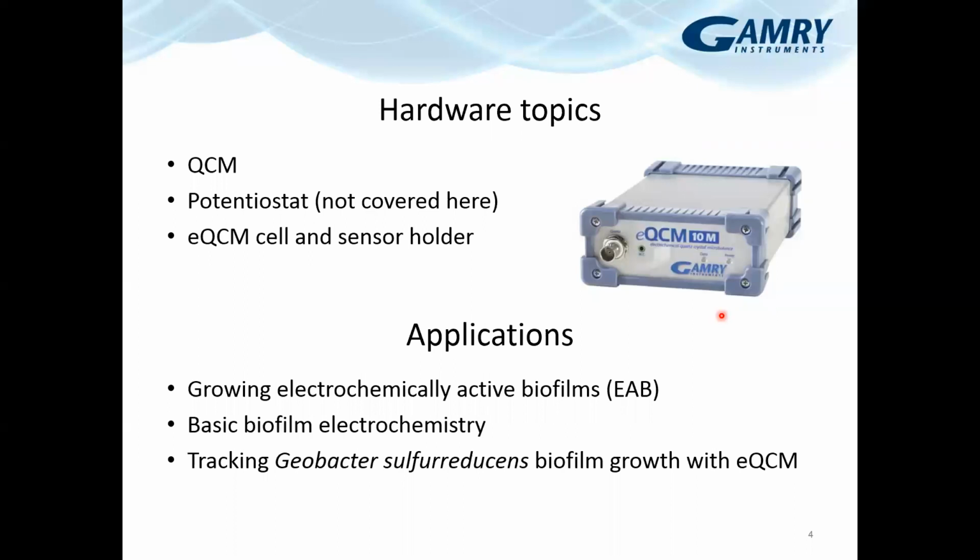And then once we get over that, I will talk about the cell, what I've used in the past, what I know actually works with biofilm protocols and growing biofilms and reactors and all of that. And then I would like to touch on some of the applications. And this is probably the meat of the talk and where you want to ask maybe questions.